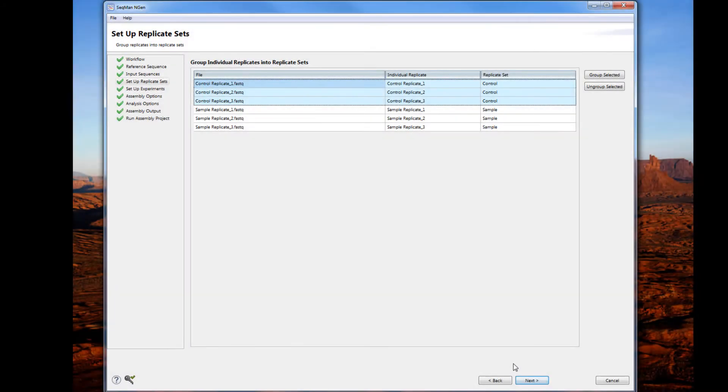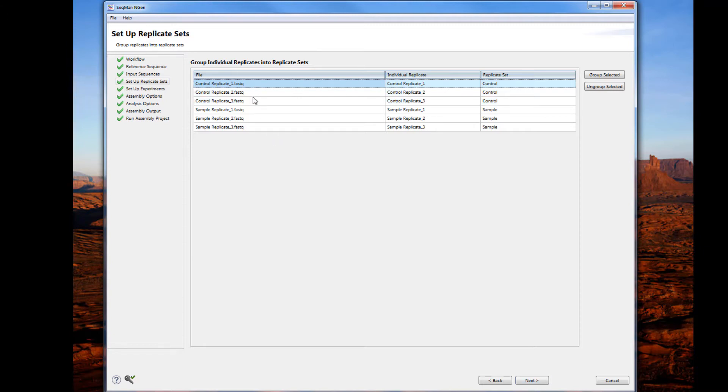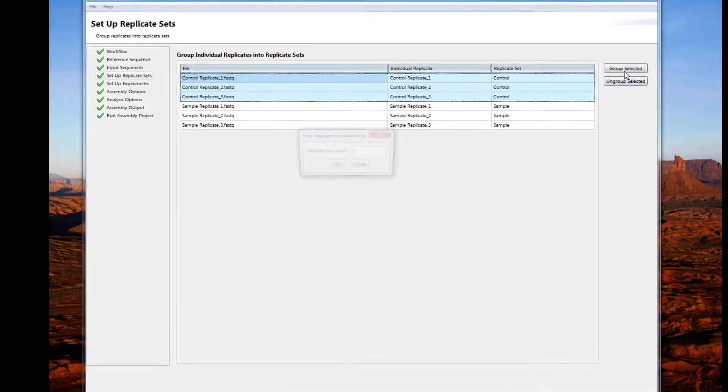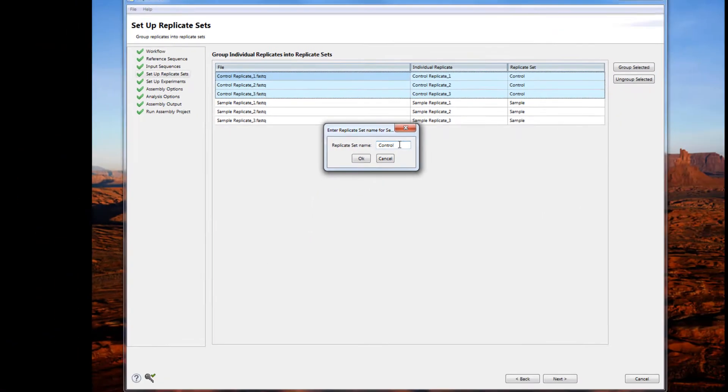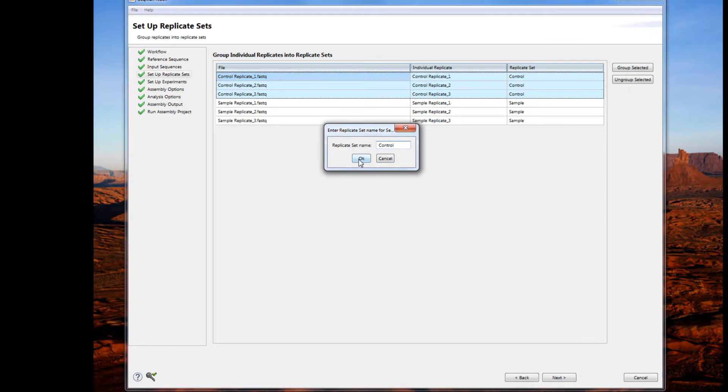In this next page, you can group your replicates into replicate sets. To do so, select the individual replicates that you want to put into the same group, then choose Group Selected. Enter in a group name and click OK to complete grouping the replicates into a set.